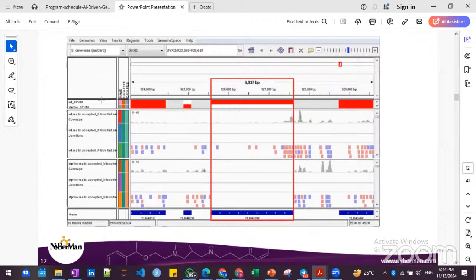So you can see row 1 is here, where we can see different reads in red color and blue color. So this is for one sample, and then the next three rows are for the second sample. Okay, but there are different types of files uploaded here, so that also I will explain to you later when we do some analysis on that, how we visualize our data actually.